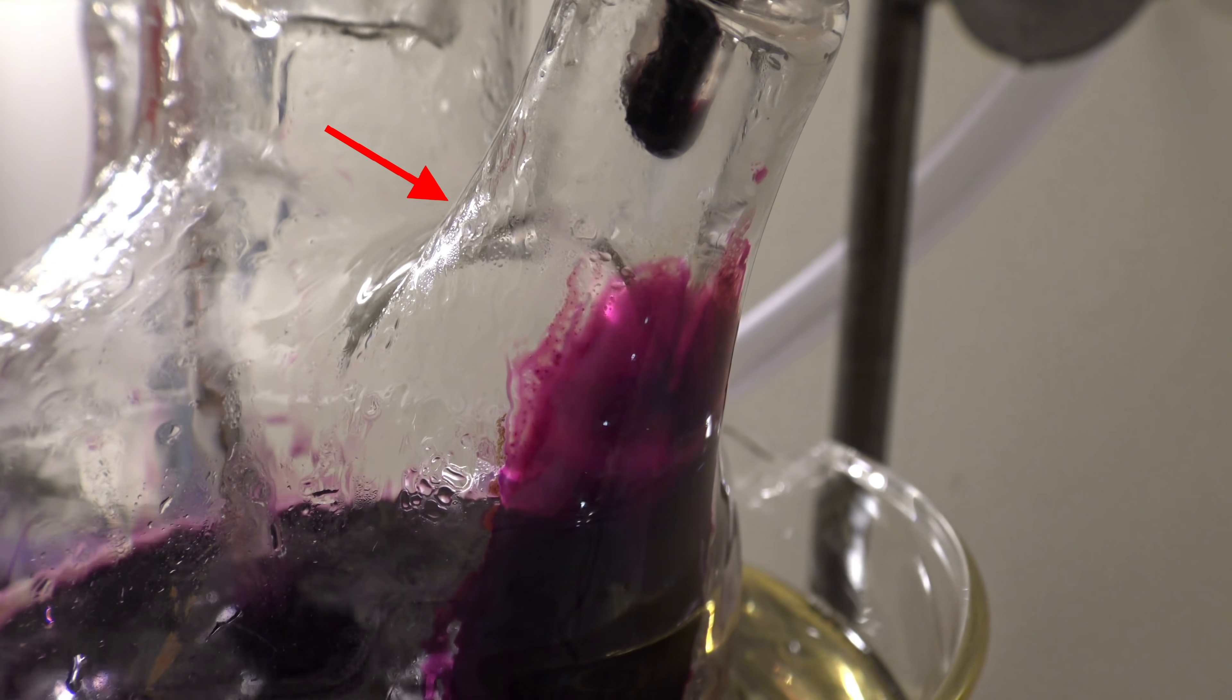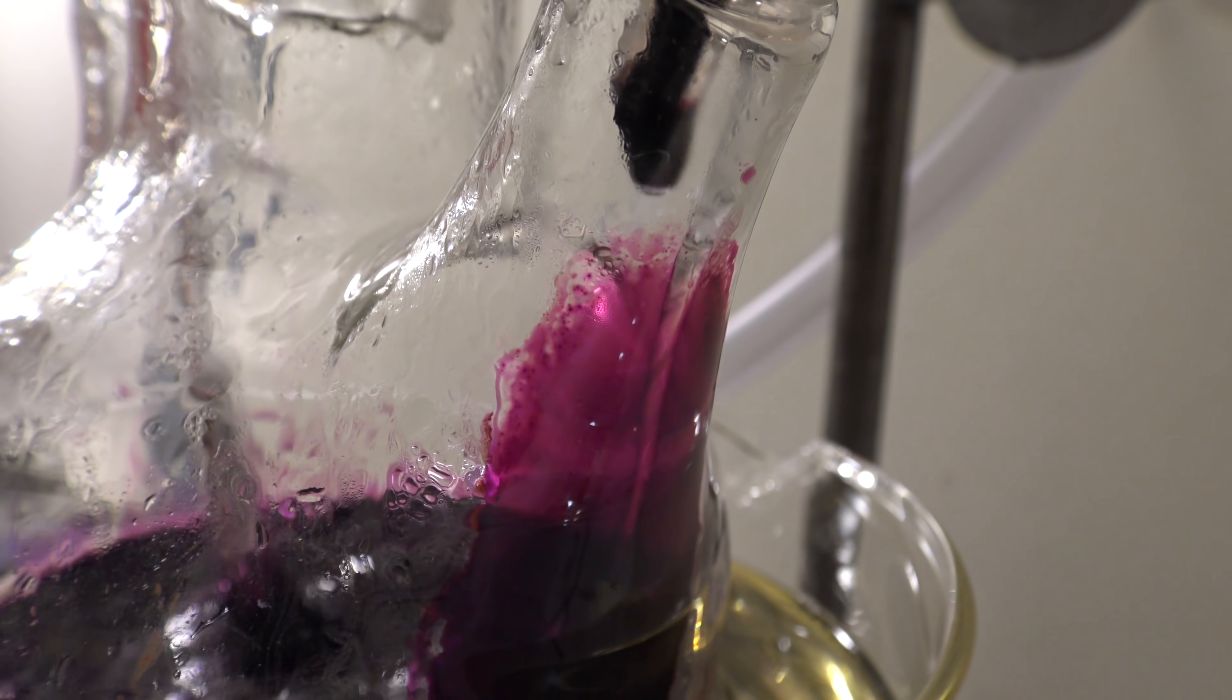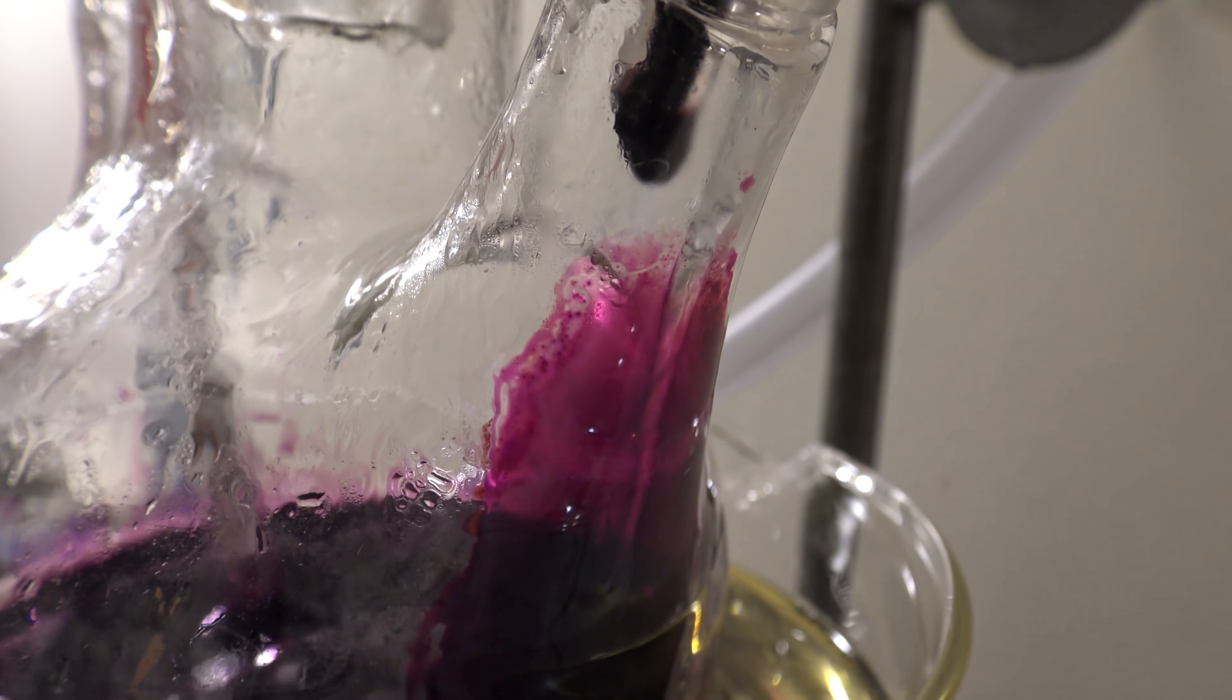When the azeotrope cools, it separates into toluene and water again. This can be used to see if there are still large amounts of toluene present.